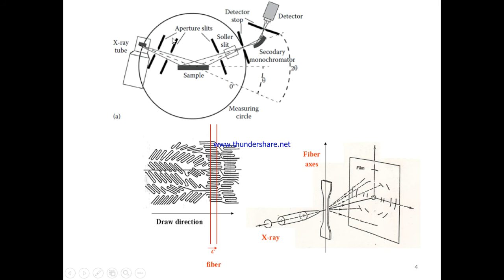So the detector will detect all the X-ray radiation coming from the sample, and the detector will produce a diffraction pattern on a photographic film or in a camera. The diffraction pattern obtained by the X-ray diffraction instrument is very informative. Now we need to analyze the diffraction pattern. You need to know how to analyze the diffraction pattern.